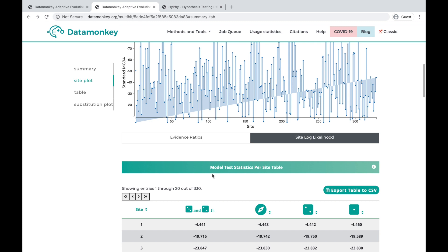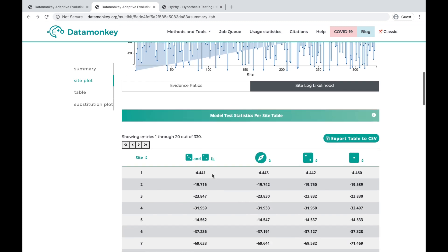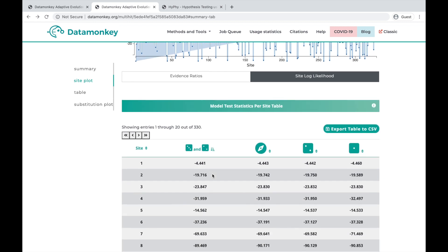Then, scrolling down, we see that there is a site-wise table with the site log likelihoods right now for each of these models.